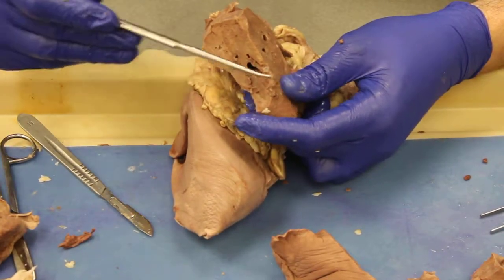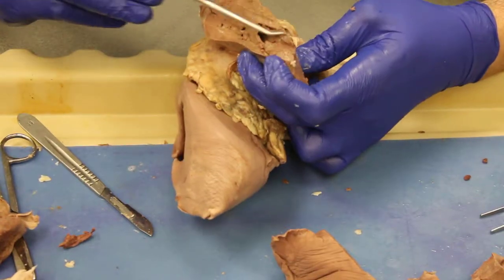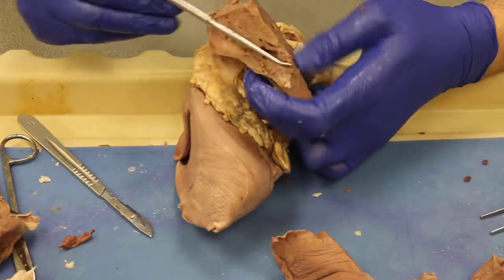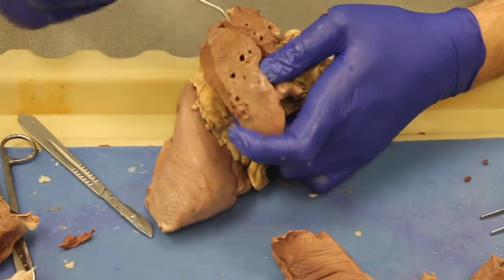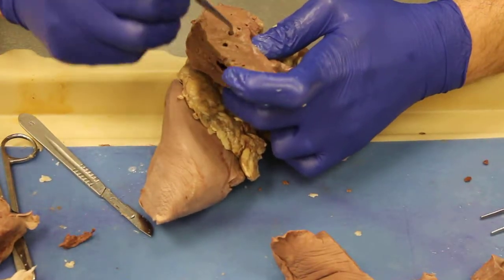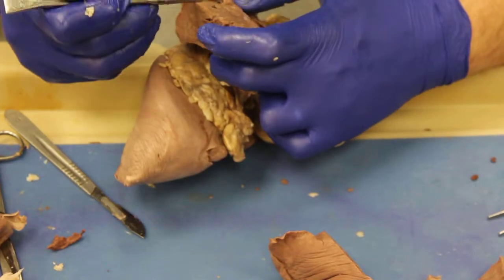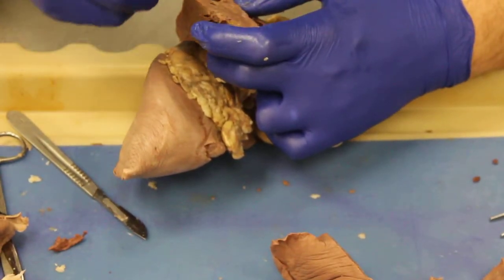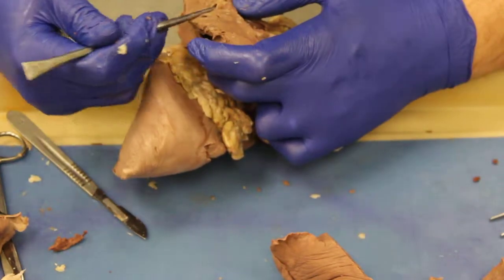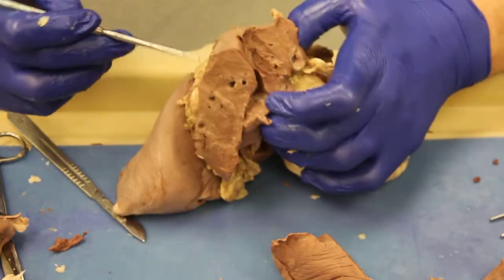So these branching points right here are the secondary bronchi. Now I've cut them away slightly, but this is where they would have led. So now all these points are points of bifurcation that lead back to an original source. So these pieces would meet together. If I went back and curled my probe around, it would come back through and I would see it again. So this is how the lung is structured.